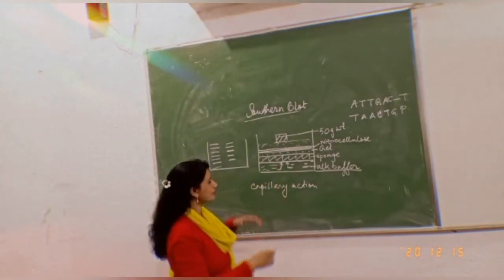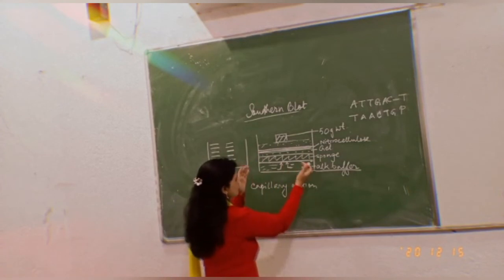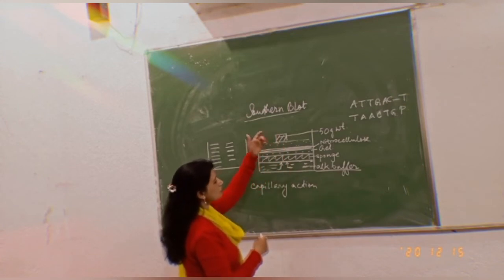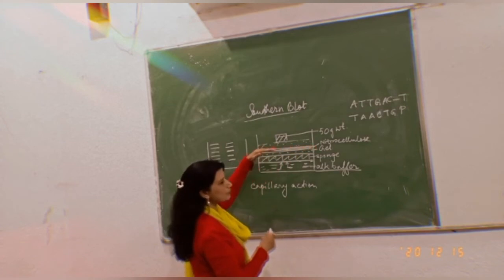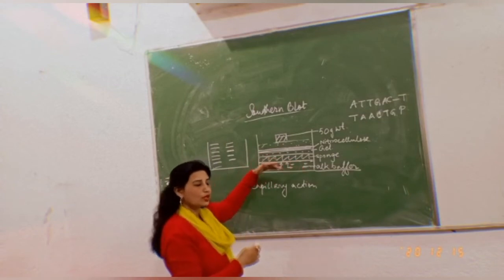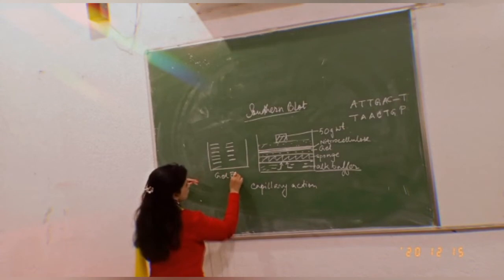How do I get it? I have applied all the methods. The nitrocellulose membrane was aligned on the gel. The DNA molecules moved up. Buffer molecules also moved up. DNA remained in the nitrocellulose membrane, giving me the exact replica, the exact copy of the image that was already prepared by me using the gel electrophoresis method.